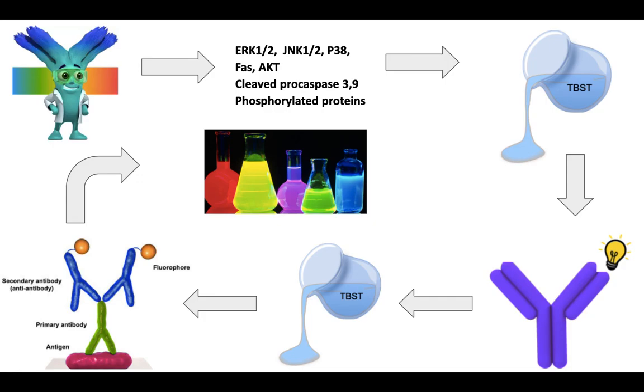Additionally, a control is also used. A control is used in the form of no azelaic acid, such that we can see whether these apoptotic proteins are upregulated depending on the presence of azelaic acid or not. This also informs and enables reliable results to identify whether azelaic acid is really having an influence.